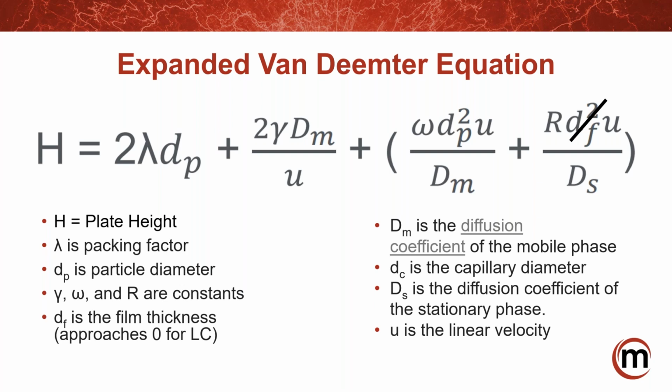When you look at the B term, that term also gets minimized because gases will diffuse very, very widely in a chromatographic system, but in a liquid chromatography system, the other effects of the liquid, like your hydrogen bonding and van der Waals forces, cause the liquid to sort of stay together. So the B term tends to be minimized as well.